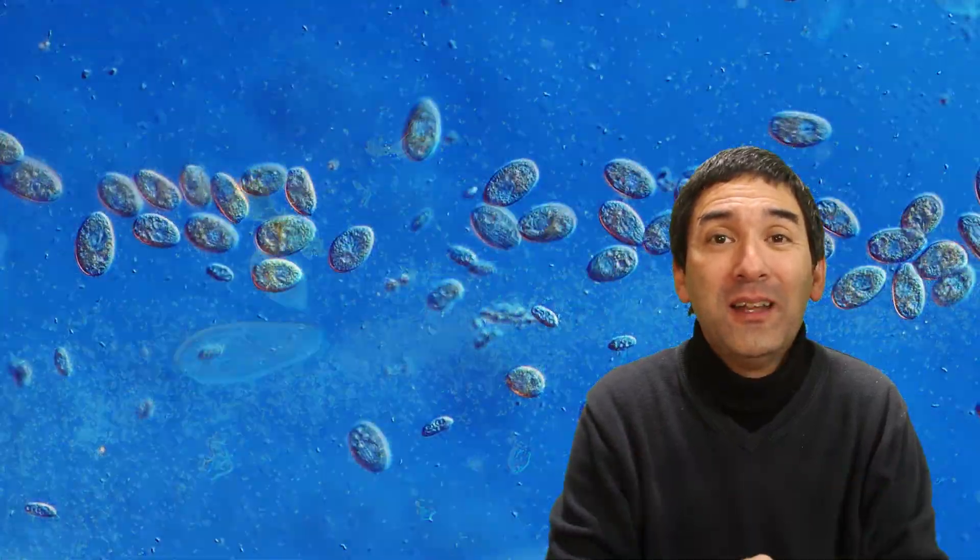So here we have, here we've got it. So that's basically how ciliates, including paramecium, vorticella and many others, how they feed on bacteria.